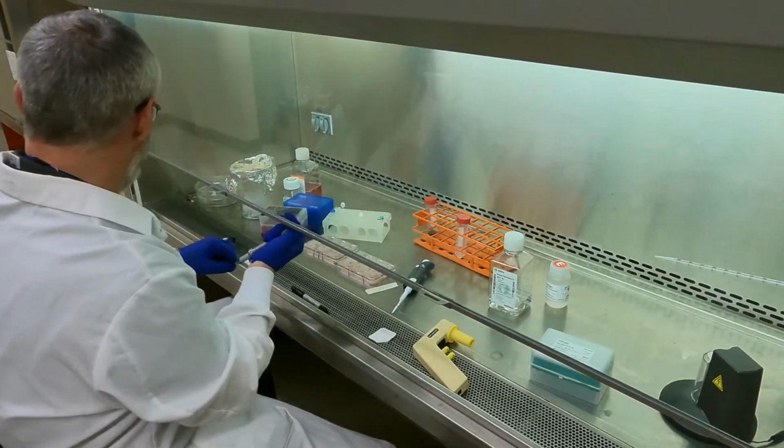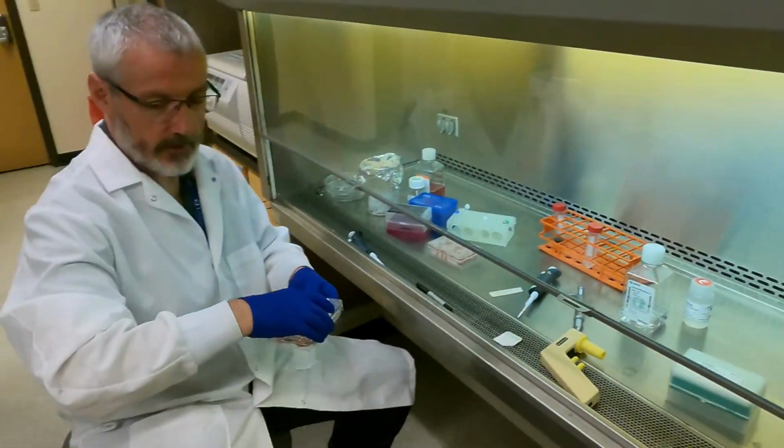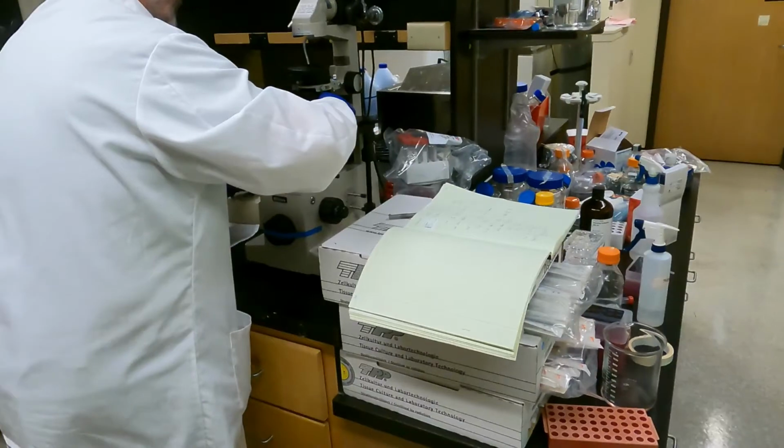Right, okay. Now, the best thing to do is just have a quick look at the cells, make sure that the cells are okay.